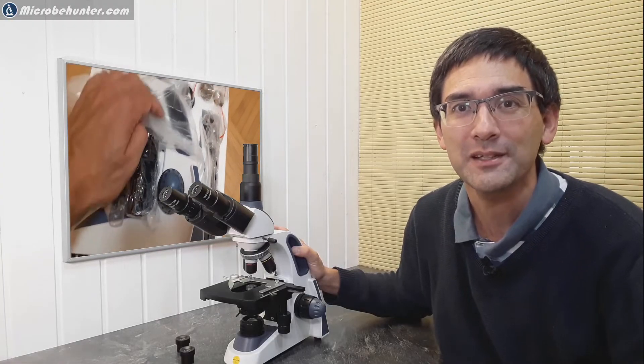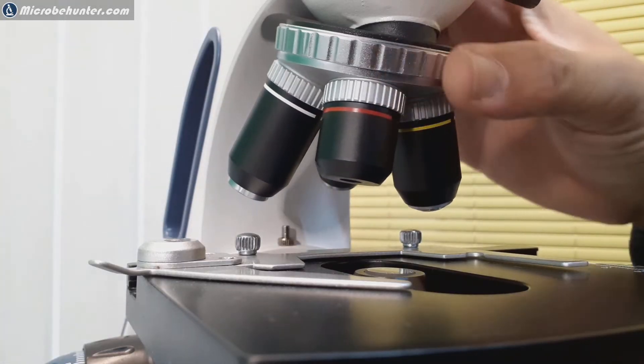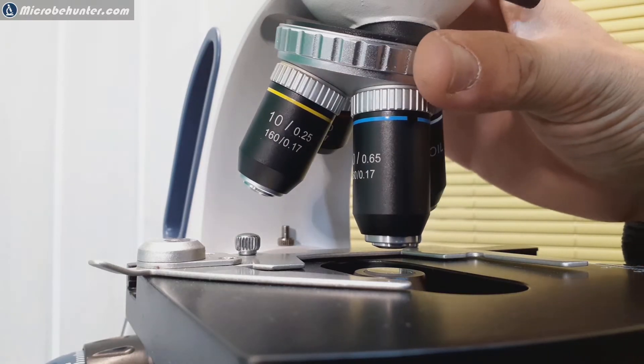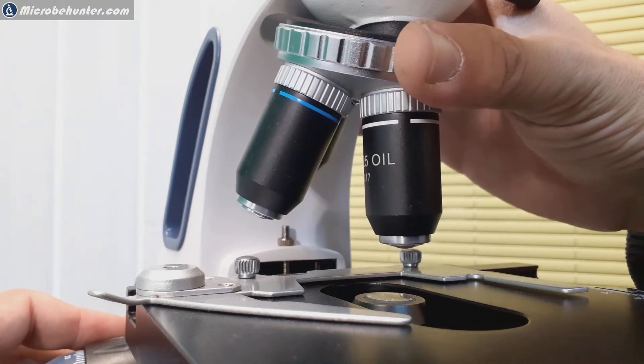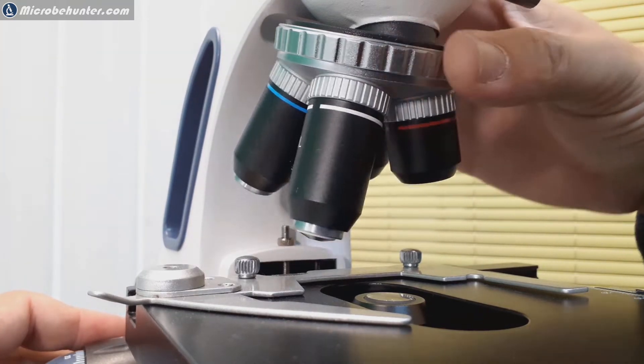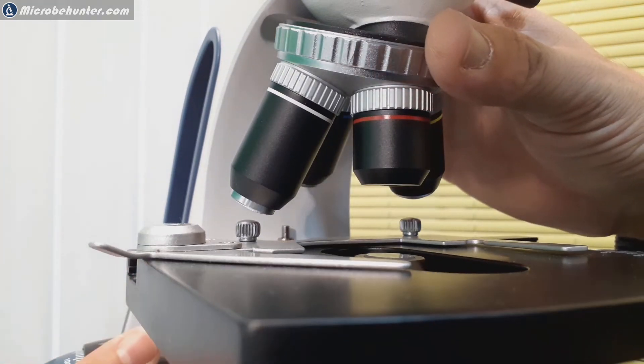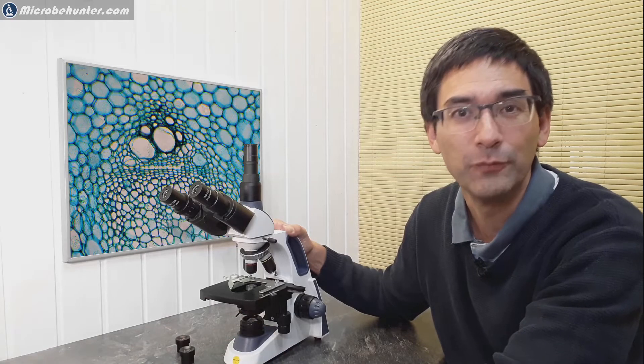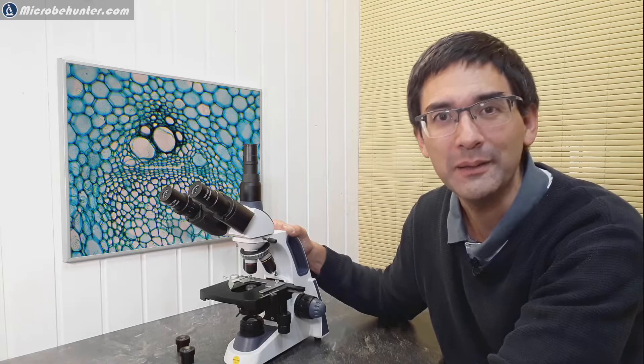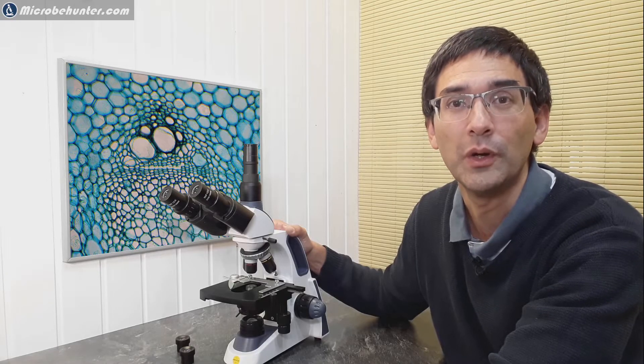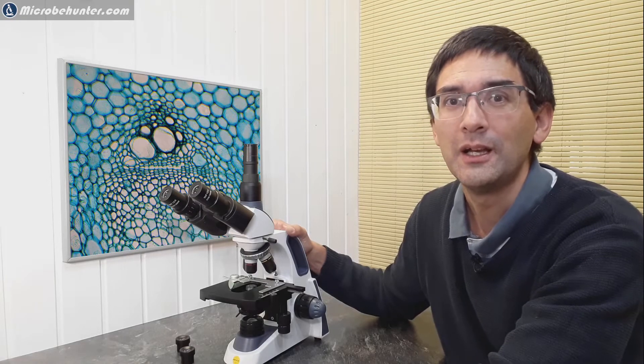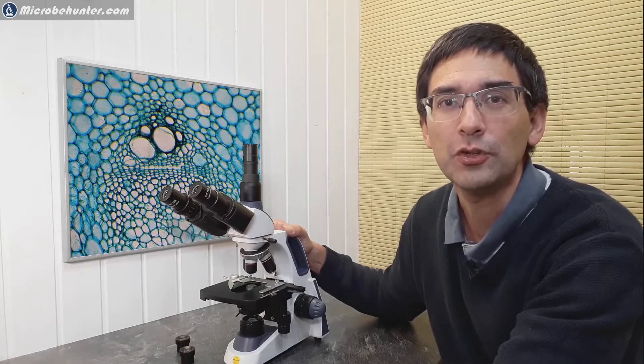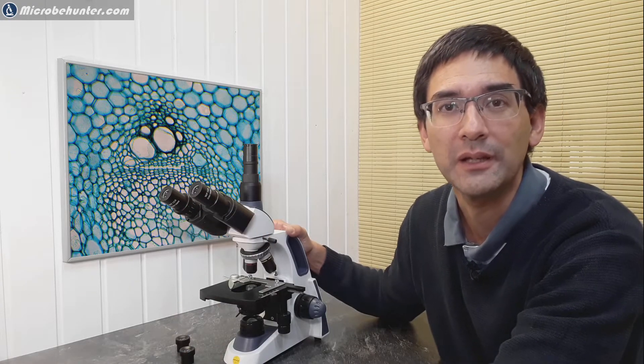What I'd like to do now is show you a close-up of the different parts. We're going to start with the revolving nose piece where the objectives are connected. It comes with four objectives: the standard objectives are 4x magnification, 10x, 40x, and also 100x oil immersion, so with those 10x eyepieces you can get magnification up to 1000x.